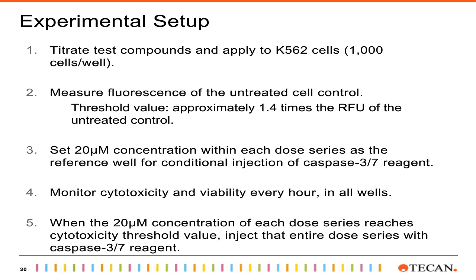Also with this experiment, we did one titration series of each compound on the plate. We did not do replicate titrations as we did in our previous experiment. So the cytotoxicity threshold that we just referenced needs to be determined before each experiment. So prior to beginning the measurements, we determined the RFU background of our untreated control and then multiplied that number by 1.4 approximately to set our RFU cytotoxicity threshold within the software.